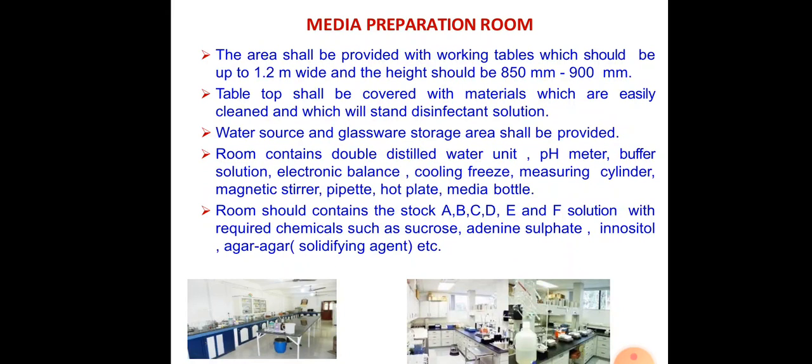And another one is we should have some stock solution reagent bottles to maintain for the stock preparation, and the chemicals should be sucrose, adenine sulfate, inositol, agar, and other vitamins or hormones also should be maintained in the tissue culture media preparation room.